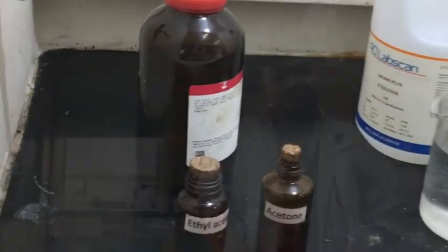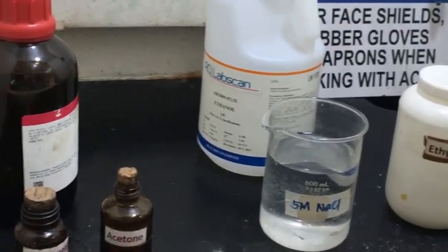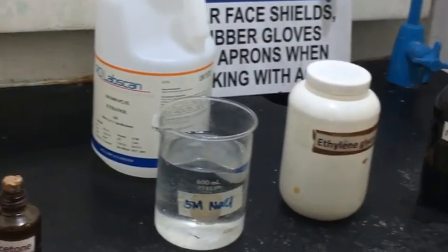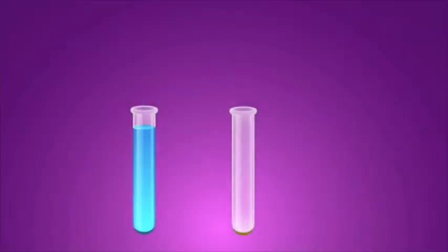The objective of this investigation is to determine the viscosity value of numerous types of chemical compounds and the effect of varying concentrations and temperatures on the viscosity value of a fluid. As mentioned in the introduction, the capillary-flow method will be used in this experiment. But before going into the details, let us first go into the preparation of the samples.